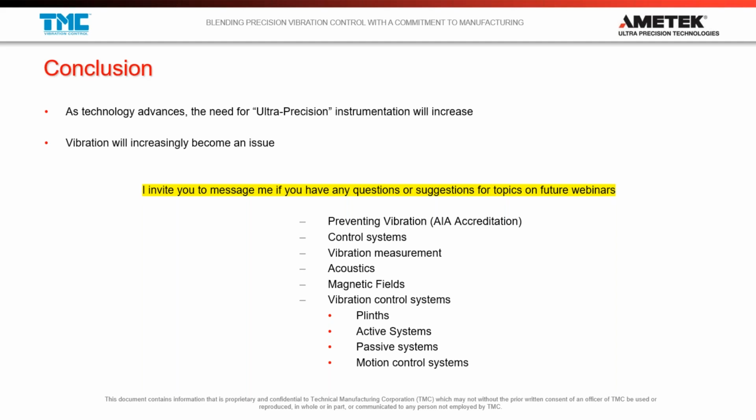Let's see. What if the vibration coming from external sources is not steady or not constant? How would we handle that? So that's an interesting one. What you're talking about is non-stationary noise. You know, it's something that happens once in a while, and you might not even know when it's going to happen.